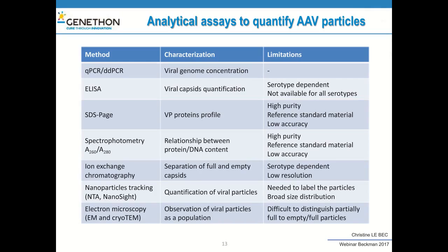You can also make a quantification of the total particles by SDS-PAGE. For that, you will need a high purity of your AAV product, but you will also need a reference standard material just to make a standard curve and to make a quantification relation between your product and the reference standard. Some people make a quantification by spectrophotometry at 260 and 280, which gives you a relationship between the protein and the DNA contents. And for this method, you also need the reference standard material.